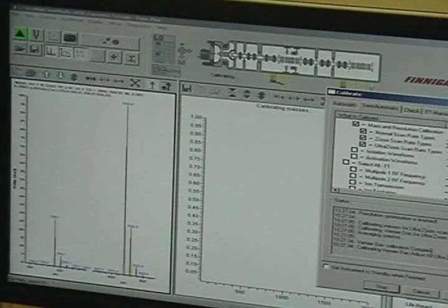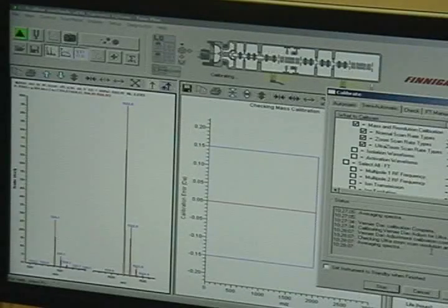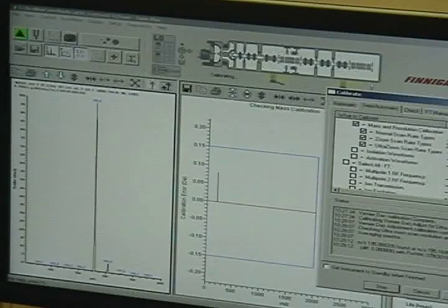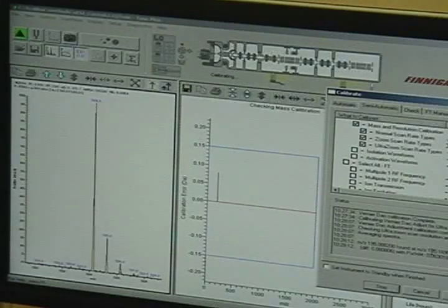It could have just been fluctuations. They seem to be consistent through multiple runs. Always found more possible compounds. These things are so hard to really see if you made a difference. Usually we use a readout of how many phosphorylation sites you discovered, because that's all we really care about. It's somewhat laborious to get that number.